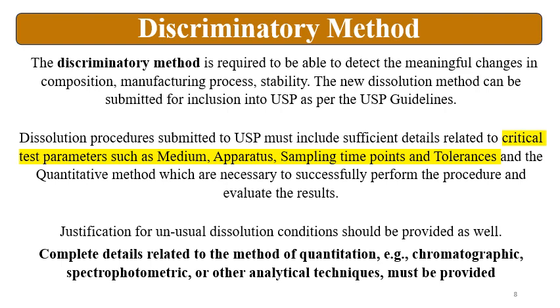Or if you are going to use 2 liters of dissolution media, then it will be an unusual dissolution condition which is very rare, and if it is there, justification should be available to use that unusual dissolution condition. Otherwise, the mild dissolution conditions like USP apparatus 1 basket with 100 rpm speed and paddle with 50 rpm or 75 rpm can be used.